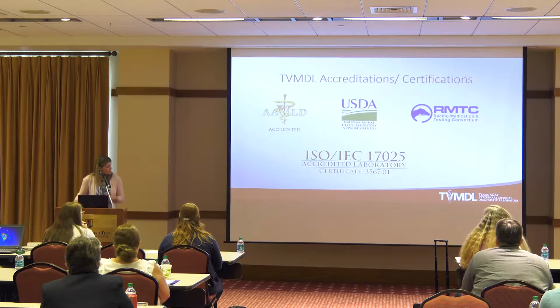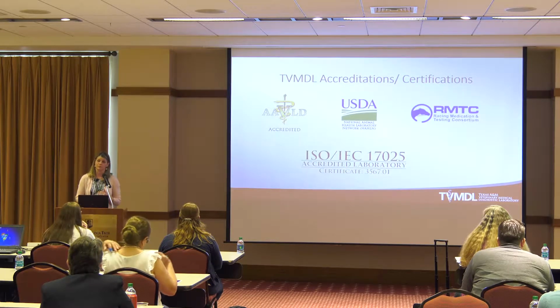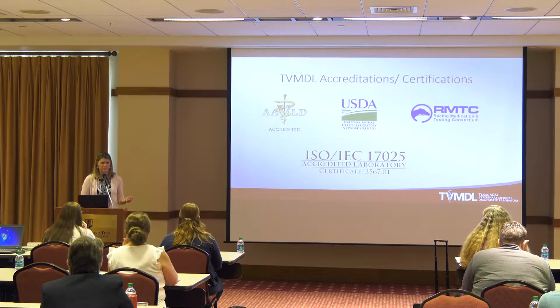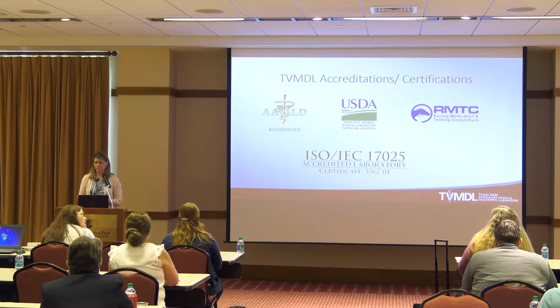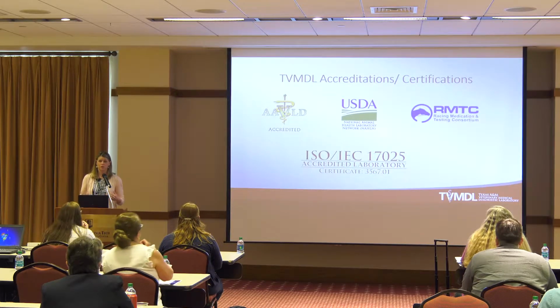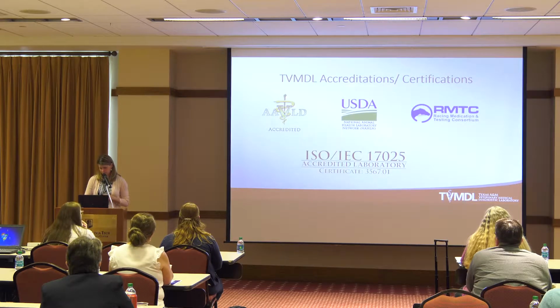We are also accredited by the RMTC, which is the Racing Medication and Testing Consortium. So our ISO 17025 accreditation is specific for our analytical chemistry lab, specifically our drug testing lab. So we do drug testing on racehorses. And the RMTC is a second level of that ISO 17025 accreditation. We participate in proficiency tests specifically for animal drug testing in the racing industry.